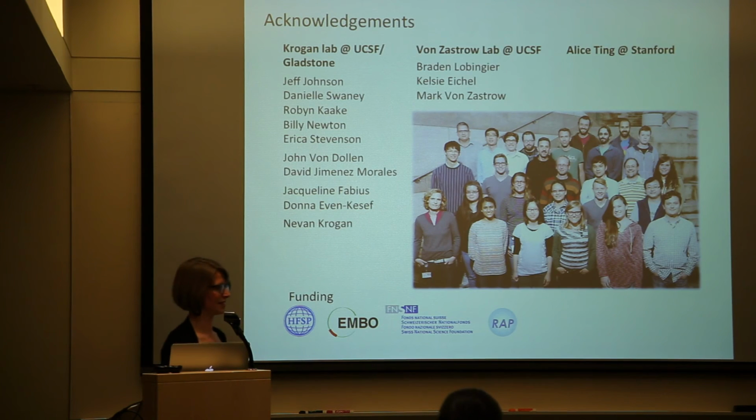Yeah. Have you ever looked, for the DOR receptor, if you do FLAG IPs, would you pick up WWP2 and TOM1? No, we didn't see these ones, and we did a few FLAG IPs, and we saw a little bit of arrestin, but not so strong. So there's really a big difference in what you can capture with APEX than with normal FLAG IPs.